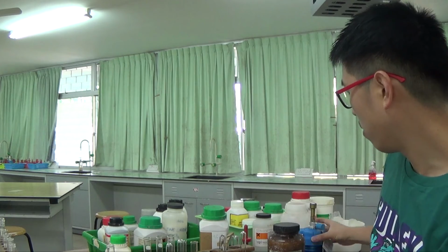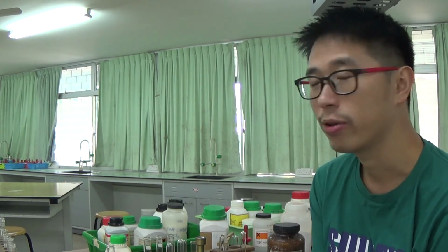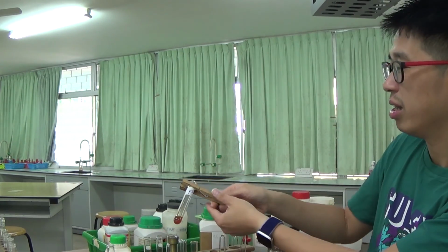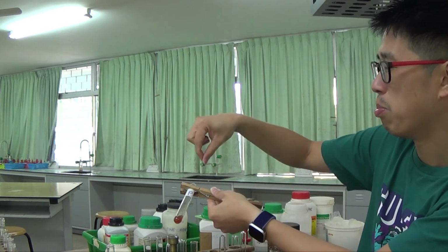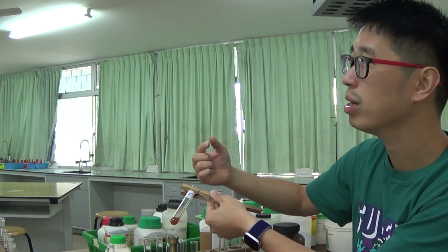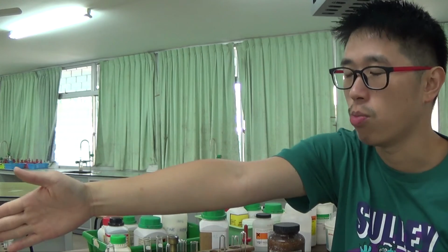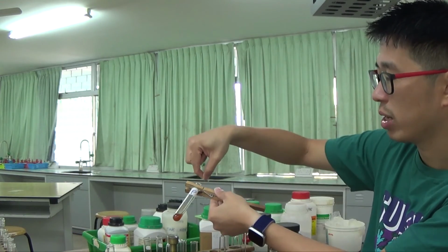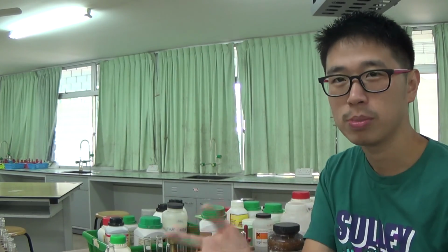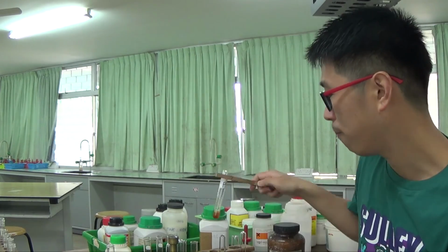I'm not going to heat it for ammonium ion here because like I said, I ran out of my red litmus paper. So I'll leave it here for today. But essentially you should turn on the Bunsen burner, heat it, get a gas, and then you have moist red litmus paper. Sorry, did I say moist twice? Moist or damp. You damp it or you moisten it with distilled water. You test for the gas. You get a pungent gas that turns red litmus paper blue. The gas is ammonia, NH3. Therefore, this contains NH4+.